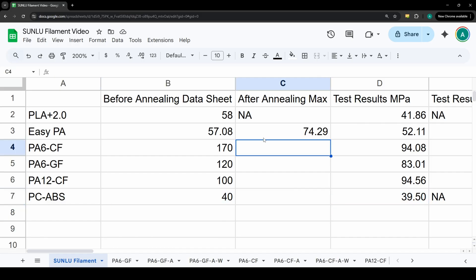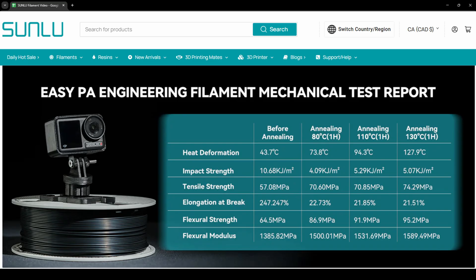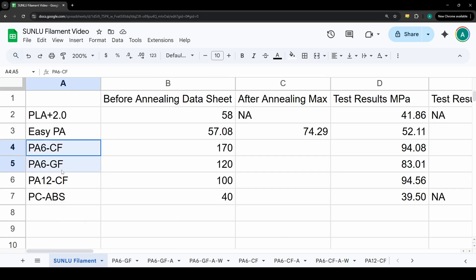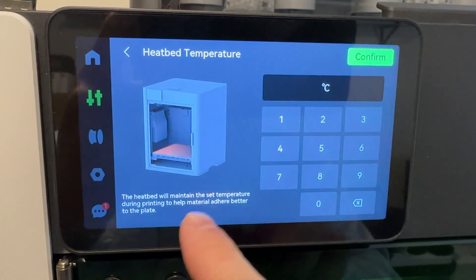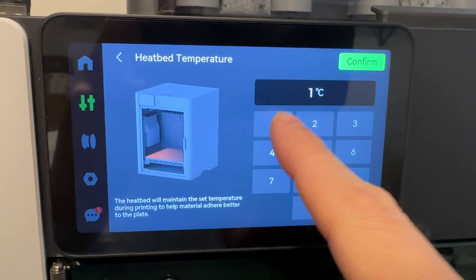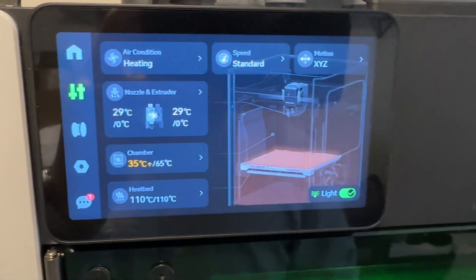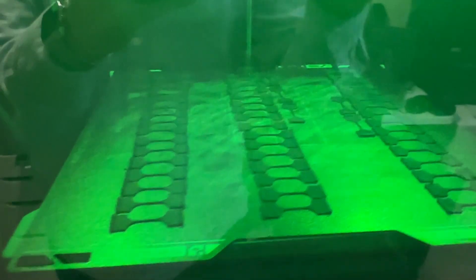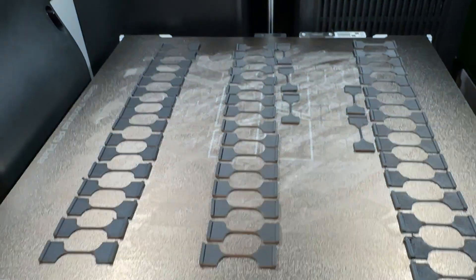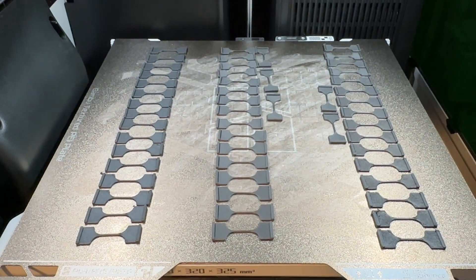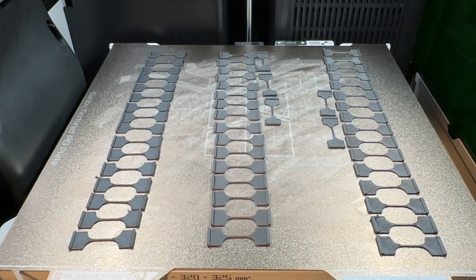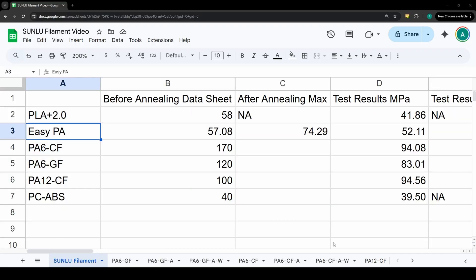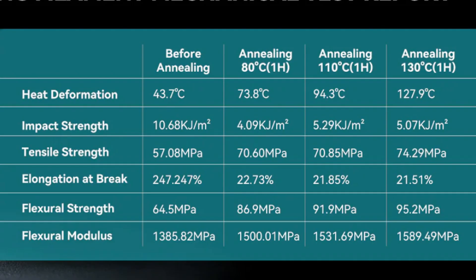Now I've mentioned the word annealing a couple times. Annealing is the process of bringing the plastic up to a temperature below its melting point for a certain amount of time and they have recommended values on the Sunlu website which is what I followed. For the PA6 and the PA12 samples I did eight hours at 110 degrees on the print bed of the H2D and there is no timeout feature on the H2D which is a really nice thing to see. I also had the chamber at 65 degrees celsius. For the easy PA they posted 110 degrees for one hour so that's what we did.